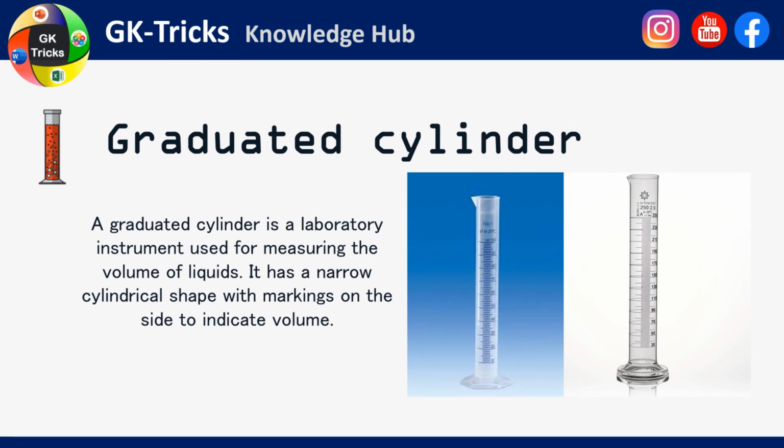Graduated cylinder. A graduated cylinder is a laboratory instrument used for measuring the volume of liquids. It has a narrow cylindrical shape with markings on the side to indicate volume.